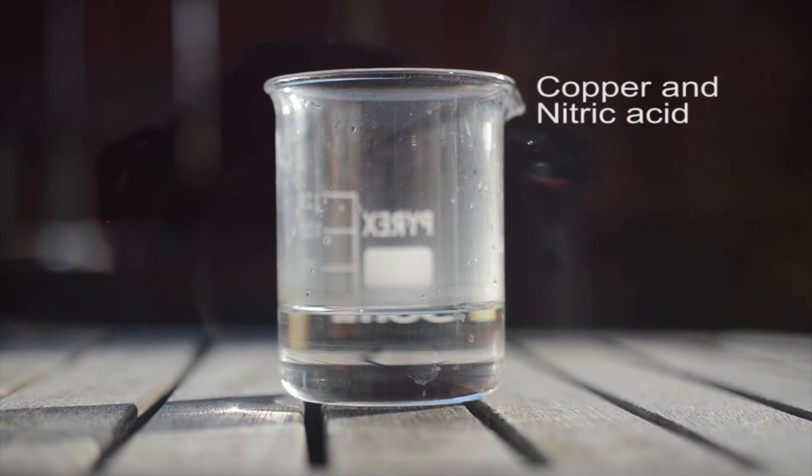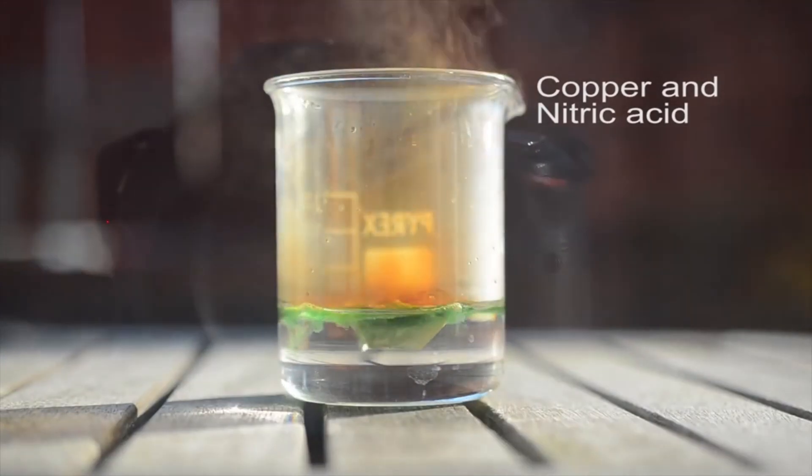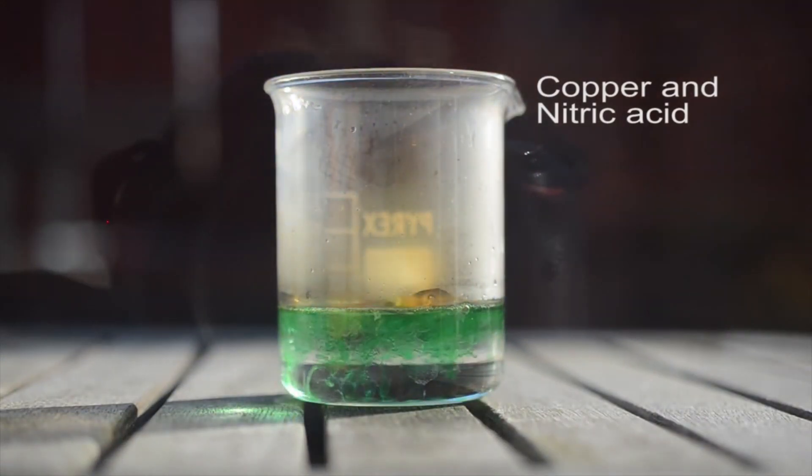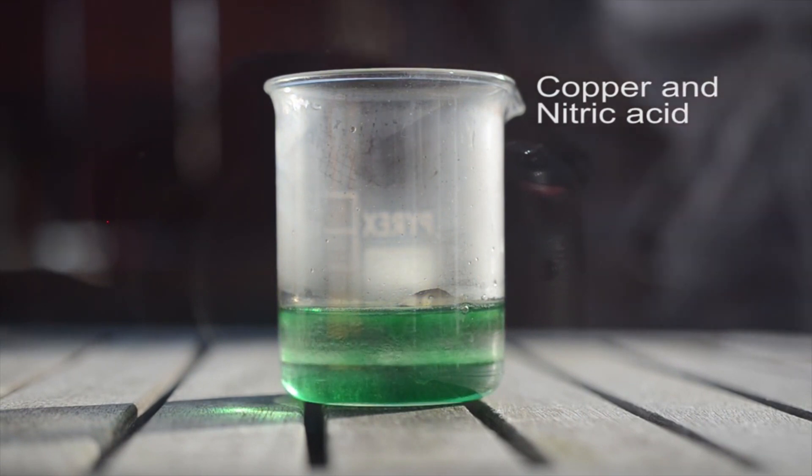The reactions between copper and nitric acid are examples of oxidation reduction reactions, where gaining electrons reduces one element and losing them oxidizes the other. Nitric acid is not only a strong acid, it is an oxidizing agent.